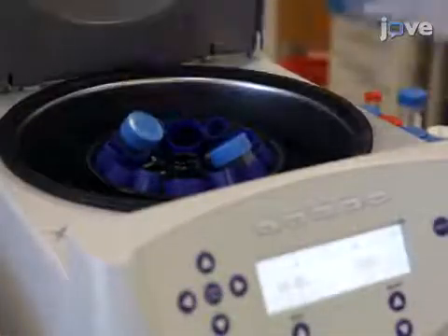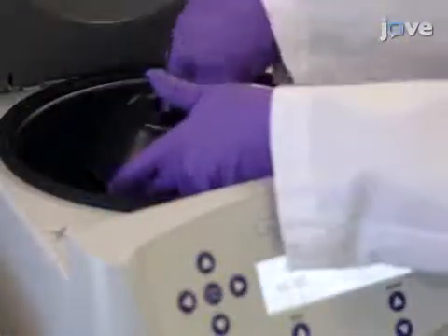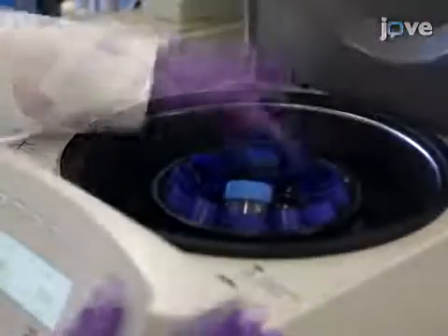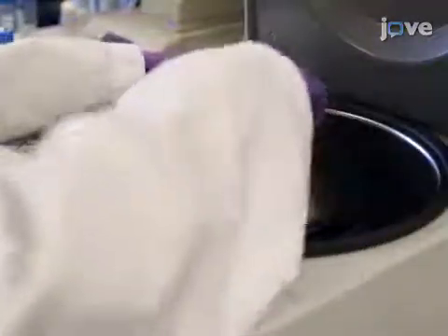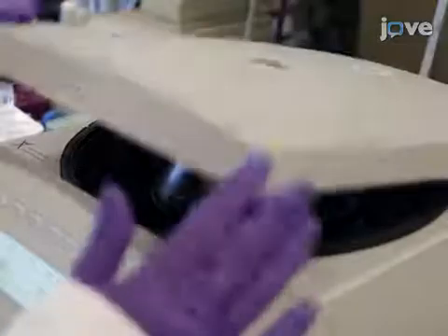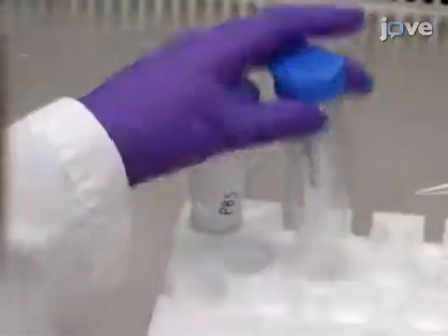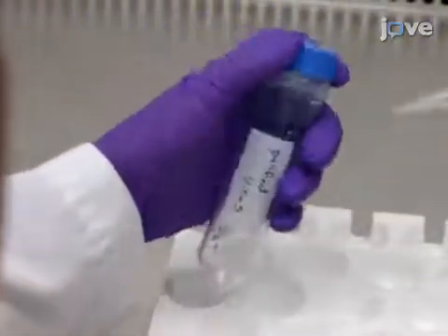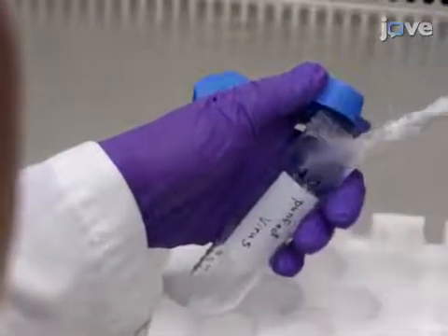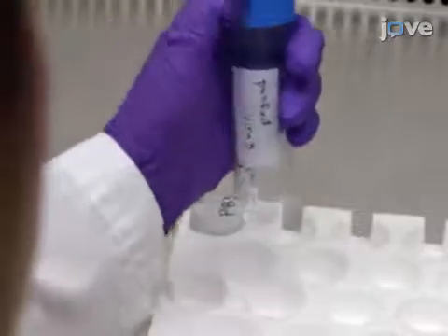On day 9, centrifuge the viral mixture at 2,500 times g for 45 minutes. After 45 minutes, discard the supernatant and spin it again for 2 minutes, followed by the removal of the supernatant again. Afterward, re-suspend the pellet by adding 320 microliters of sterile PBS and incubate on a shaker at room temperature for 30 minutes.